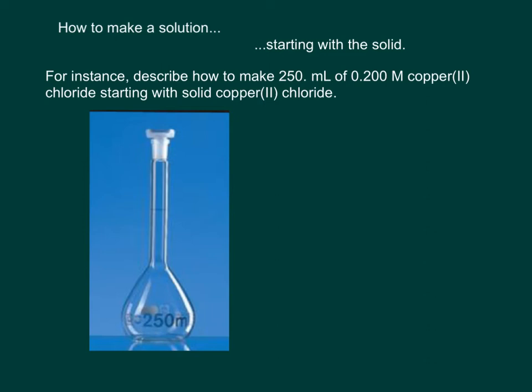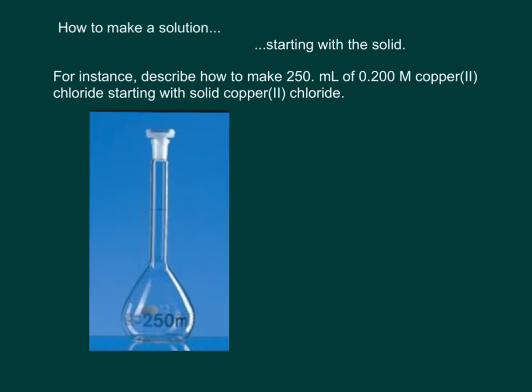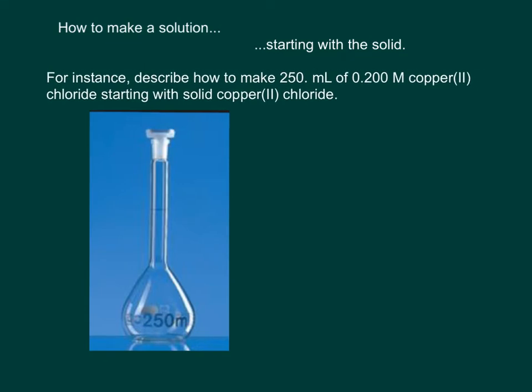Okay, so let's talk about how to make a solution. Let's say I want to make a solution of something and all I have is the solid. For instance, describe how to make 250 milliliters of 0.2 molar copper 2 chloride, just starting with some solid copper 2 chloride.